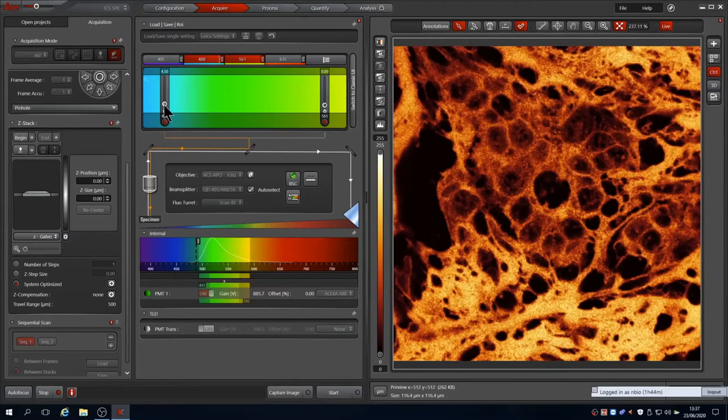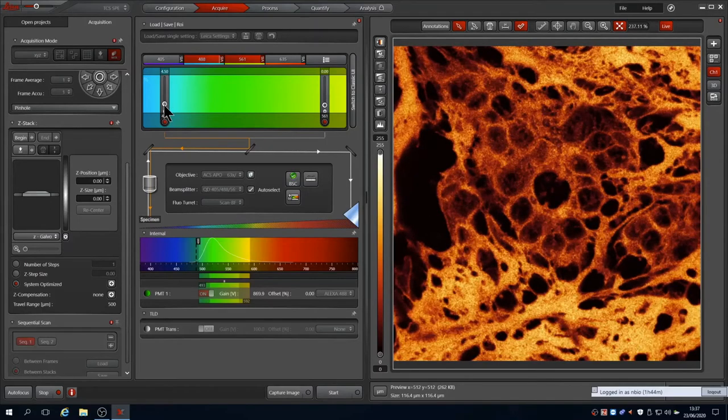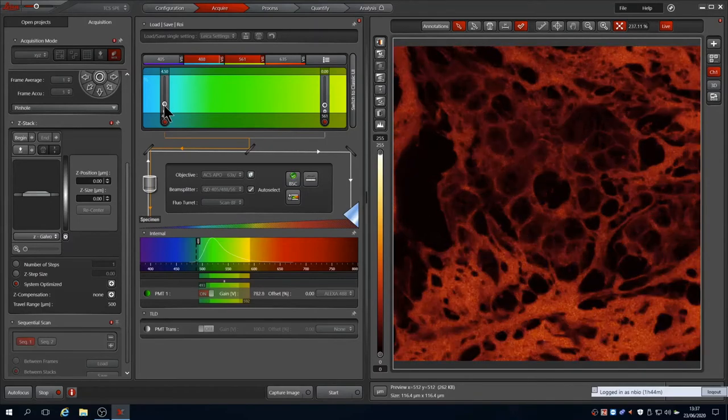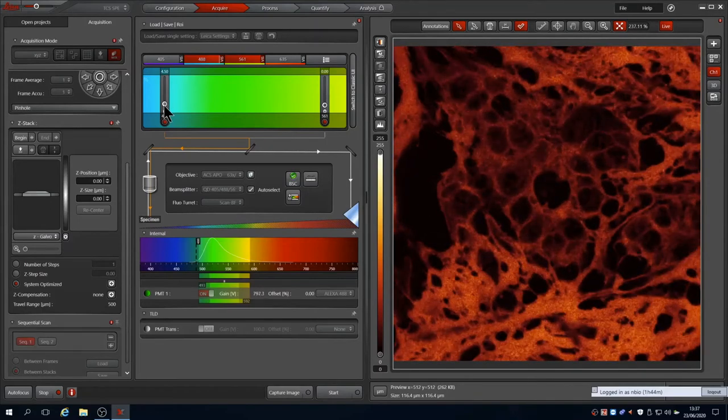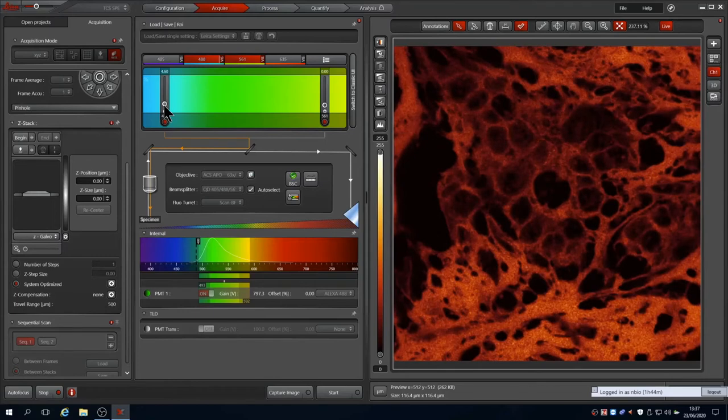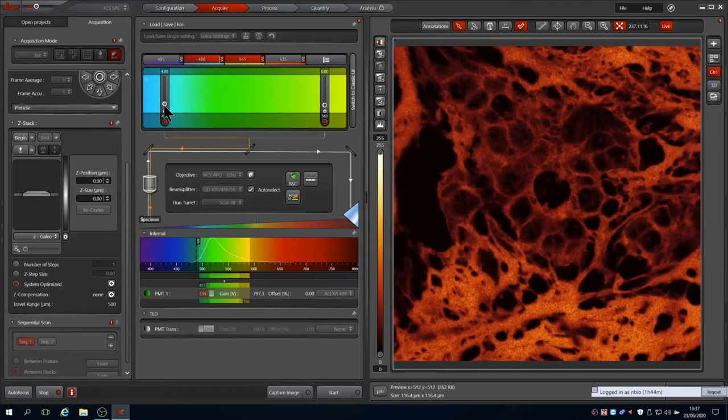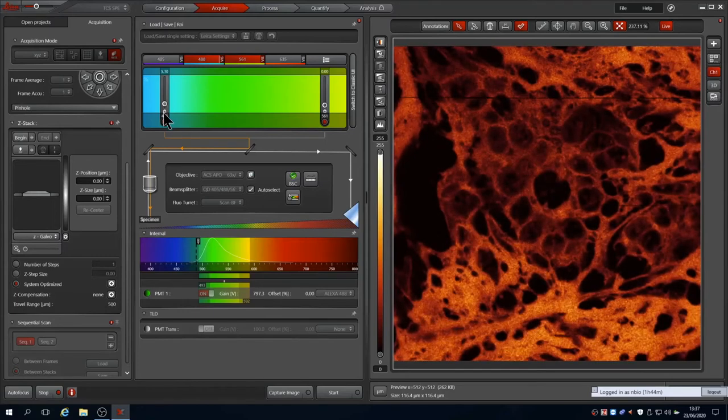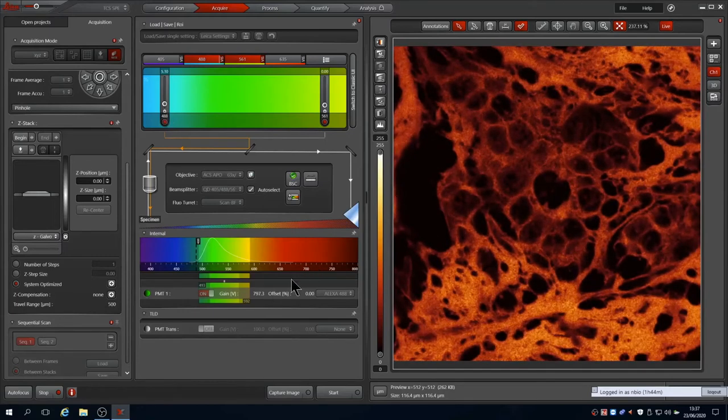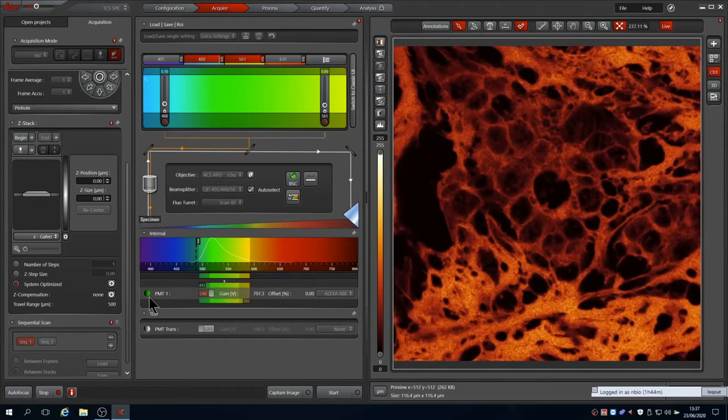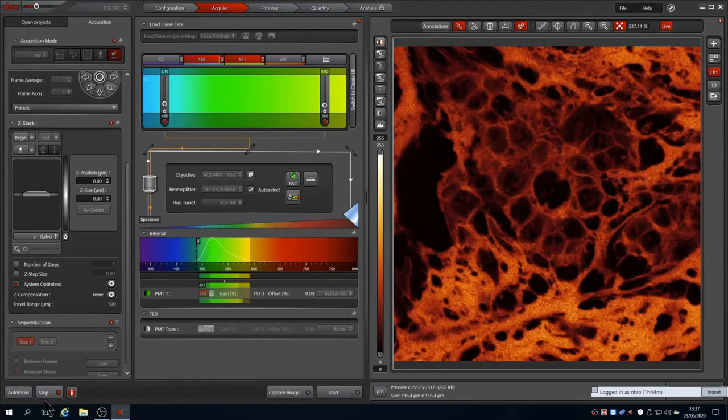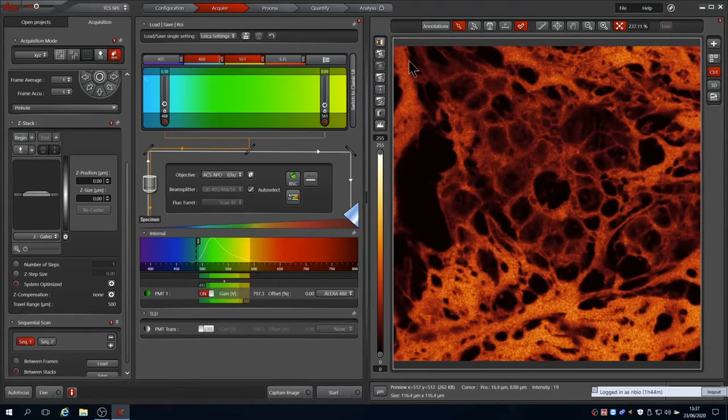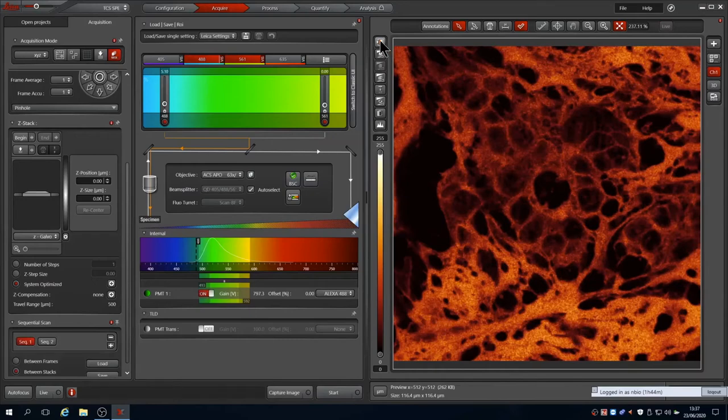Next I increase the laser power to provide a good range from the sample, and again move Z up and down to ensure that it is in the same plane as the other channel. For this particular sample it is all autofluorescence, so the two are the same. Once satisfied, press stop to limit how much light you are inputting to your sample.